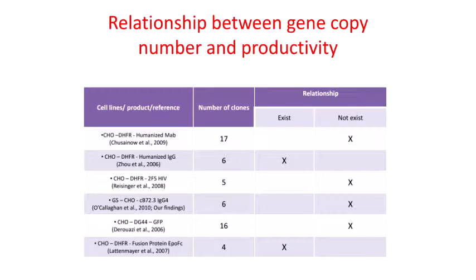And if you think about stability in terms of the molecular event to produce this recombinant protein, we are only interested in the recombinant protein. It doesn't matter what happened to the cells inside. What we wanted to see is how the productivity would remain constant. And then we look at other factors associated with the process, such as the gene copy number.